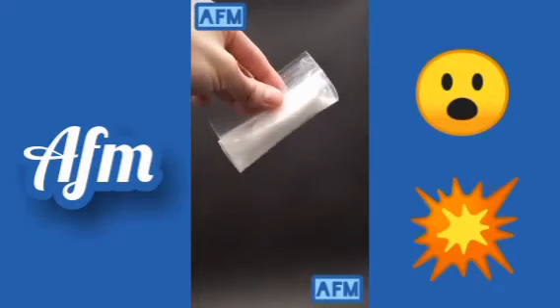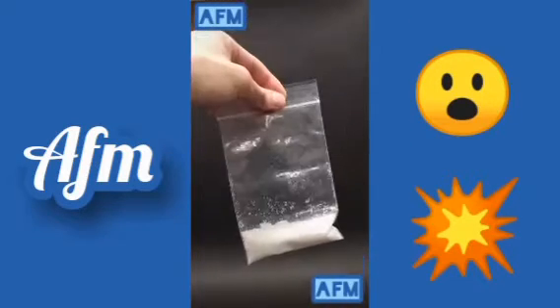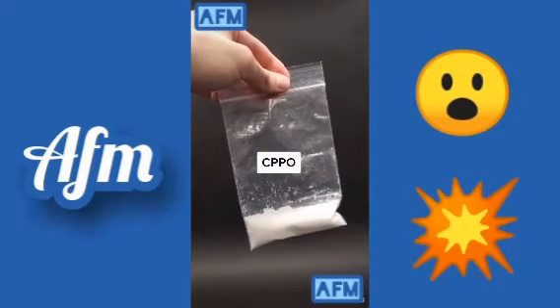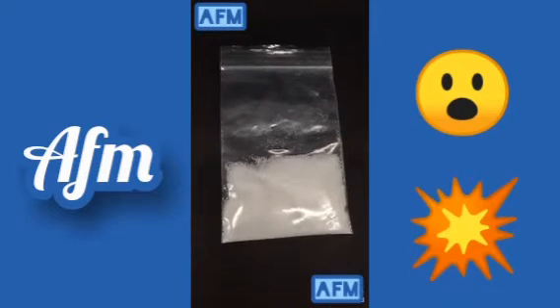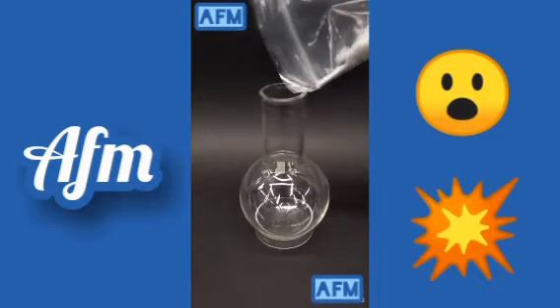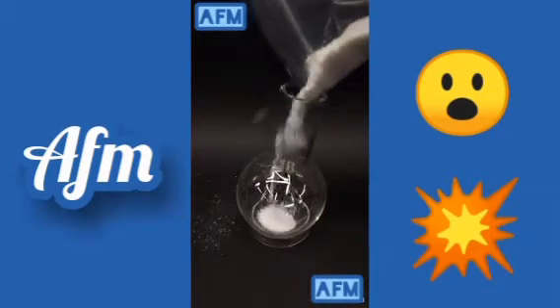About a year ago, I bought this powder from Russia. It's not sketchy though, and it's just a chemical called CPPO. Okay, that's still kind of sketchy. But CPPO is actually just a chemical that's used to make glow sticks. I've decided to finally use it and to make some giant glow stick thing. Just add a random amount here.